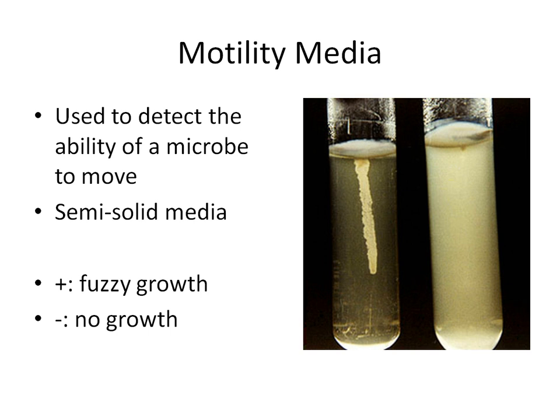Before we can get into these types of media, I need to introduce to you a new media type we have not encountered before. Up until this point in the lab, we have encountered a broth, which is a liquid in a test tube, a plate, which is a petri dish containing a solid media, and a slant, which is a test tube containing a solid media.